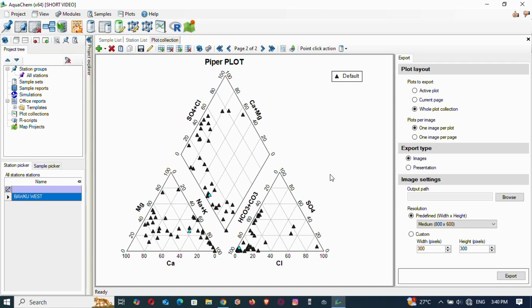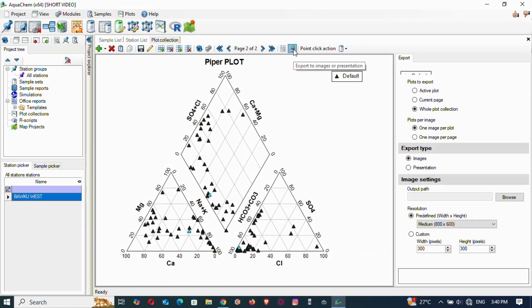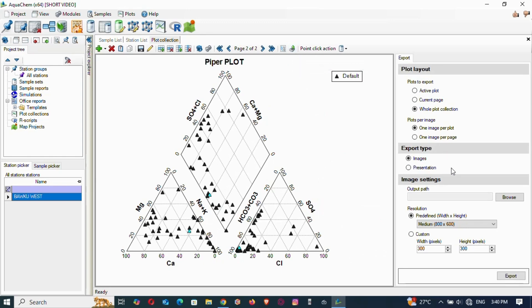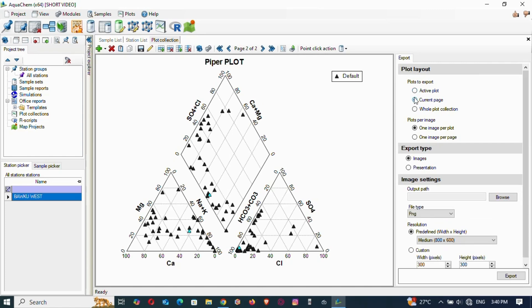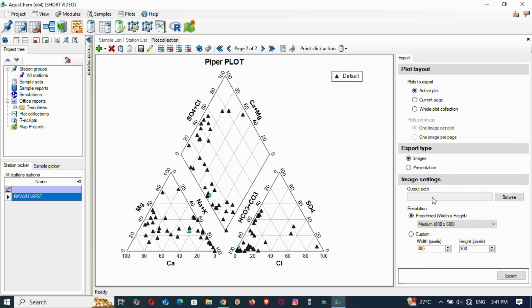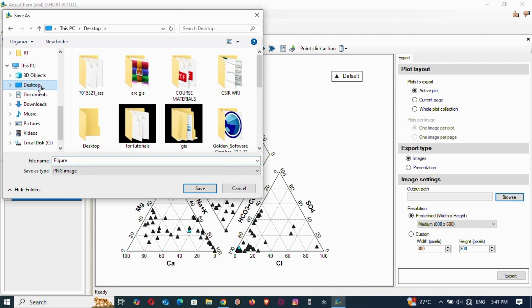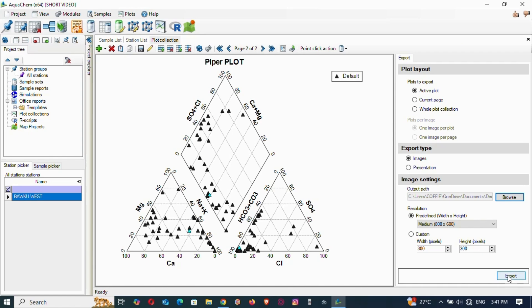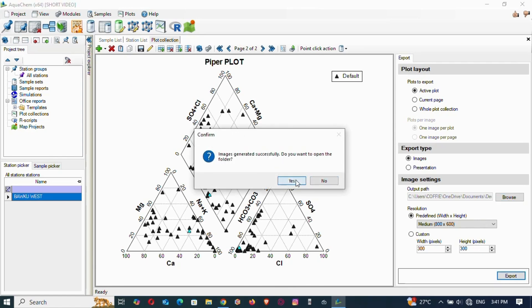When you are done, to export go to Export. Click Export and this dialog will appear. You can export the whole plot collection or just the active/current plot. We want to export this active plot. Browse to set the output path — I'll put it on the Desktop — and name it 'figure piper.' Then click Export.